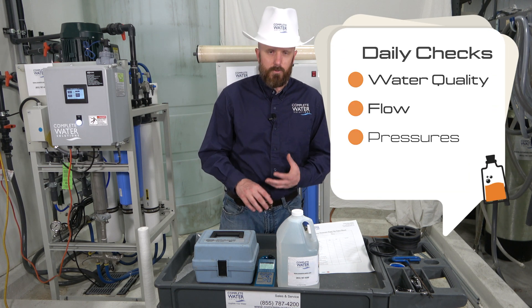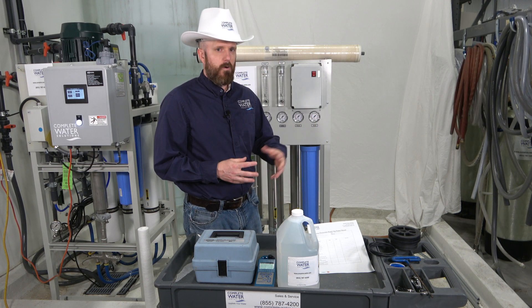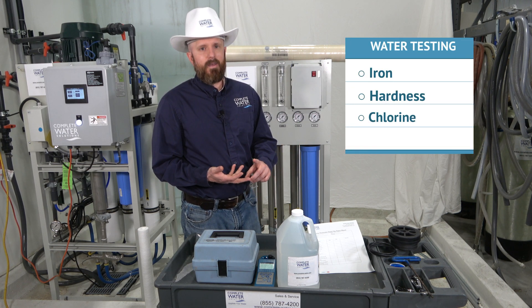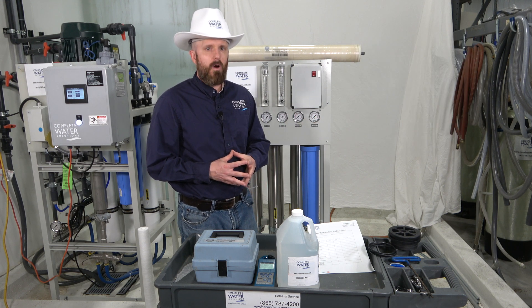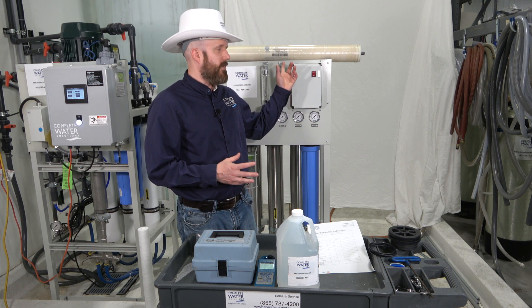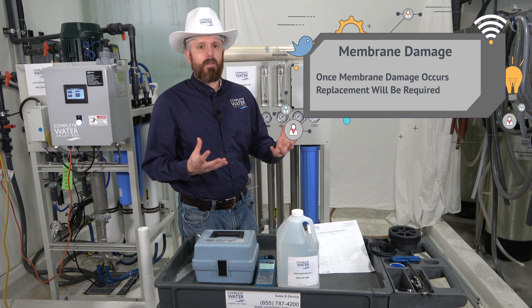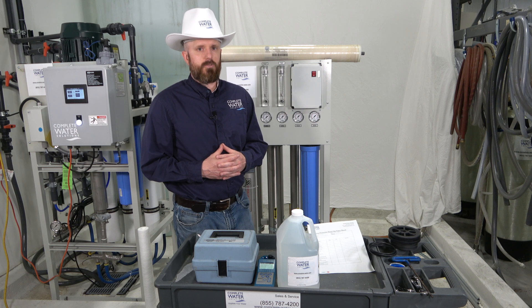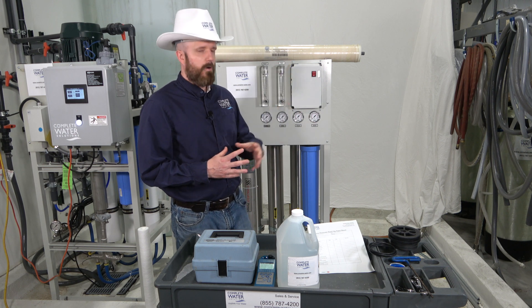The first thing you're going to want to do is a water quality check. We test the incoming water coming into your RO system. Some things that RO membranes don't do well with are hardness, iron, and chlorine — those items, if left unchecked, can cause irreversible damage. Most membranes today are known as thin film composite, or TFC, or polyamide PA, and those membranes do not tolerate chlorine long term. It will cause irreversible damage and you may have to replace the RO elements.